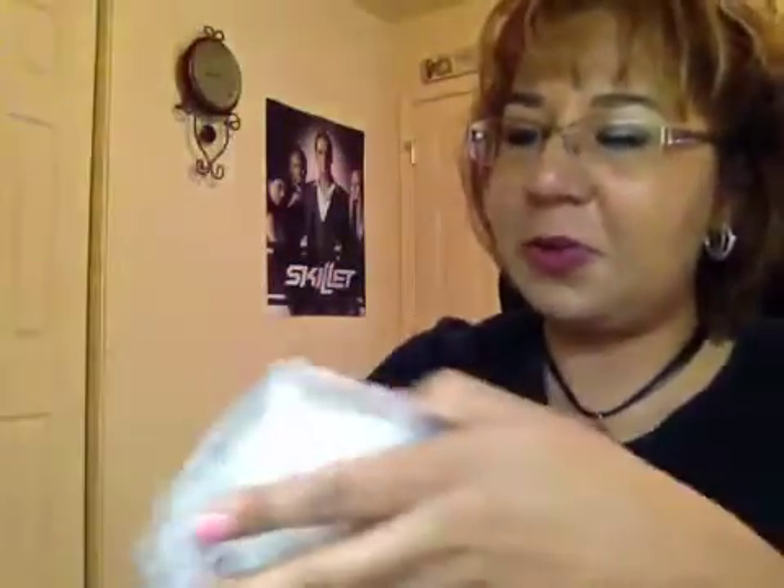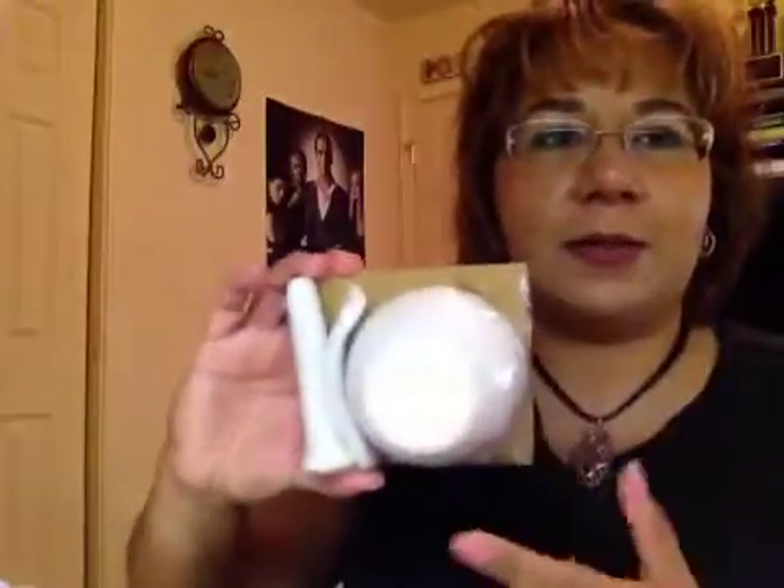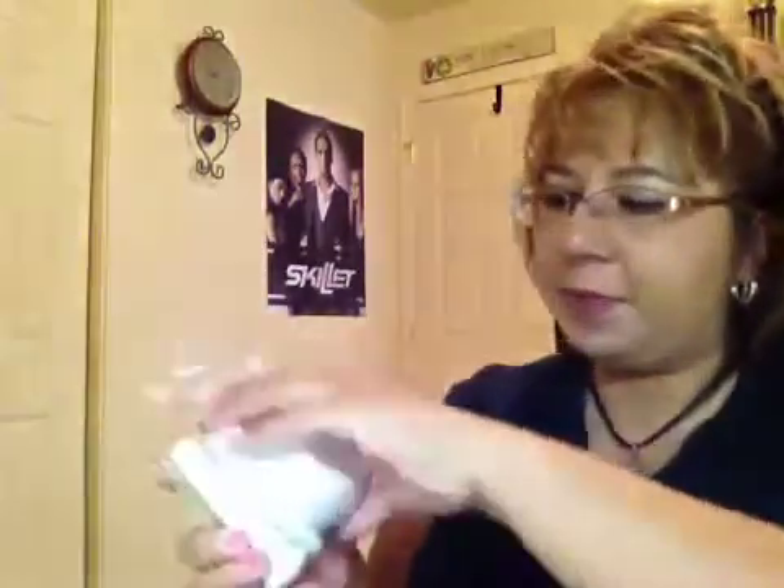One last thing in your kit that you might have trouble identifying — this is a cool little gadget. It's called a mortar and a pestle. These are ceramic, not glass. This is basically a little bowl, and the pestle is this thing right here. They're surprisingly heavy — they're real sturdy little pieces of equipment. But when it's time to crush something, you put your item in the bowl and you crush it down with the pestle, just like this.